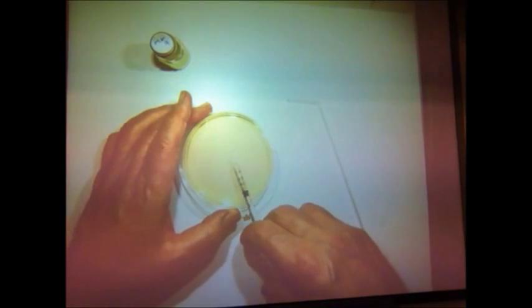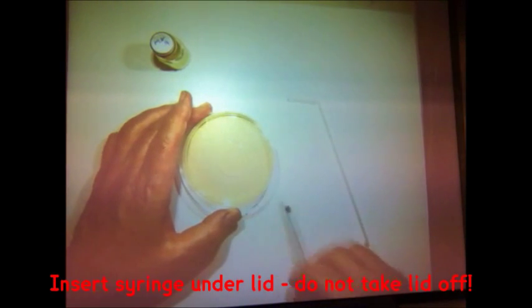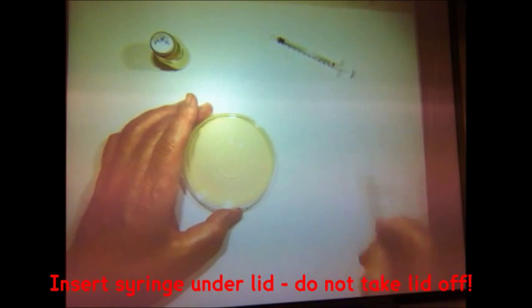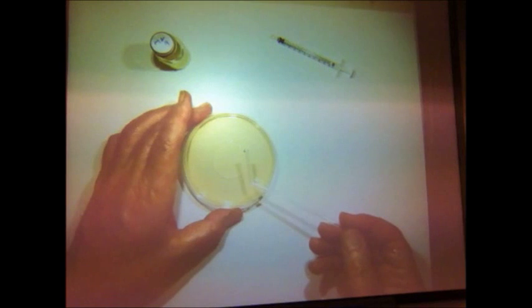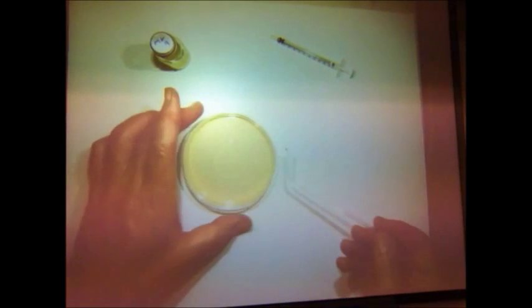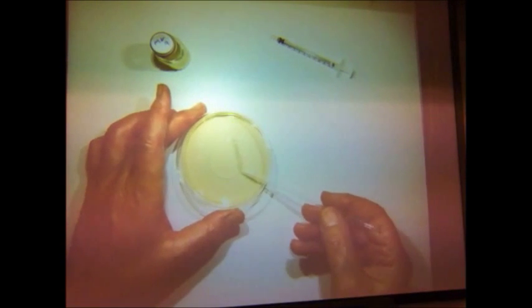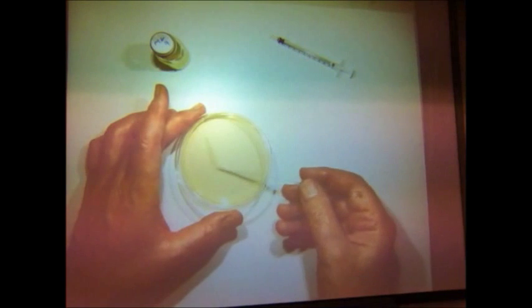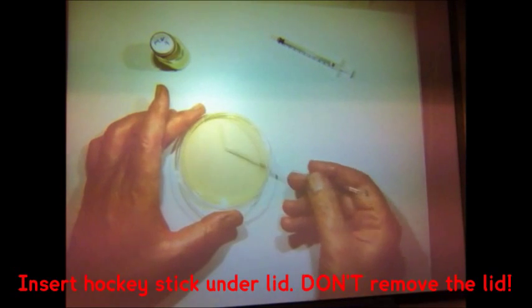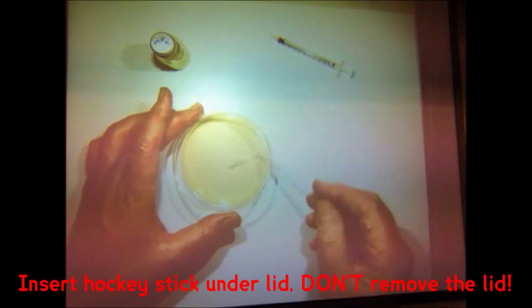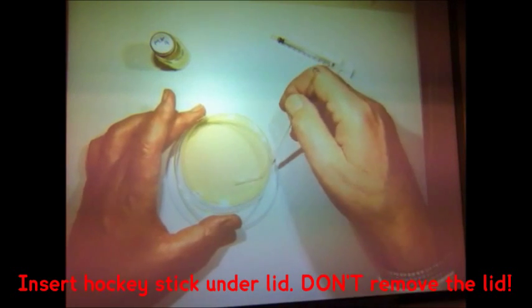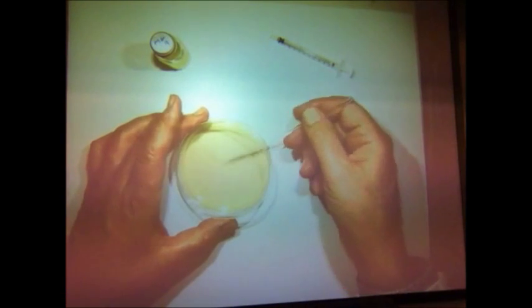What I'm going to do is peep underneath the lid, without lifting the lid off, onto the surface of the agar. That syringe will go into the discard bin shortly, and then I'm going to reach underneath with the hockey stick and very gently spread it over the surface of the agar.